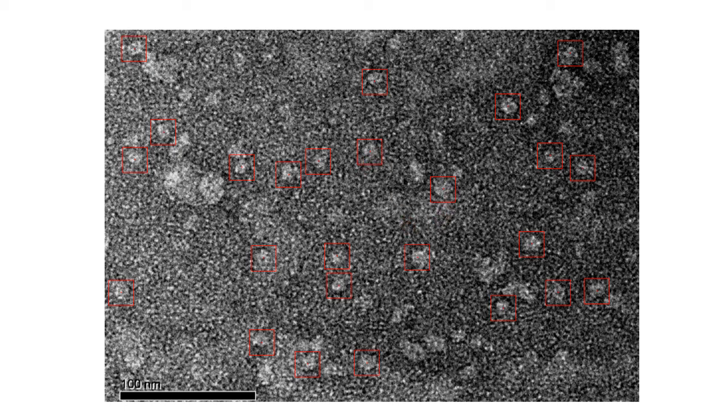These boxes are representing the molecules of the specimen. All of these are the same type of molecules. So the boxes represent the molecules which are in the same plane, in the same orientation. This information is collected and stored by using the software.